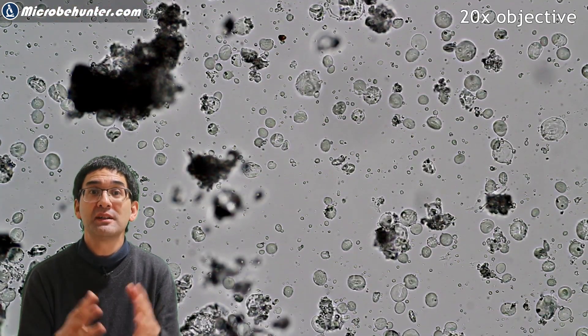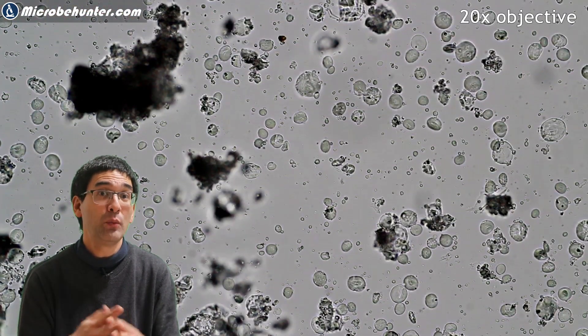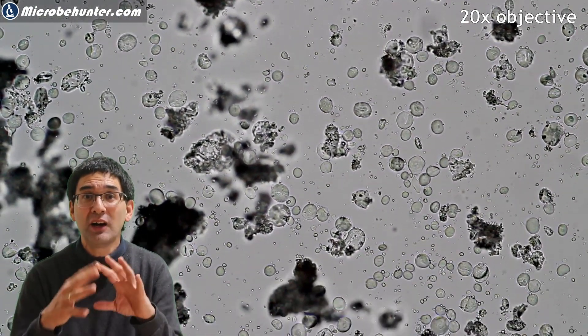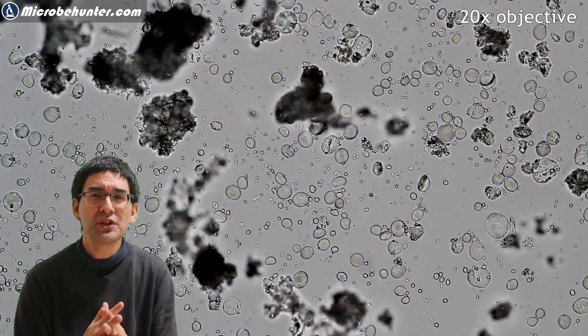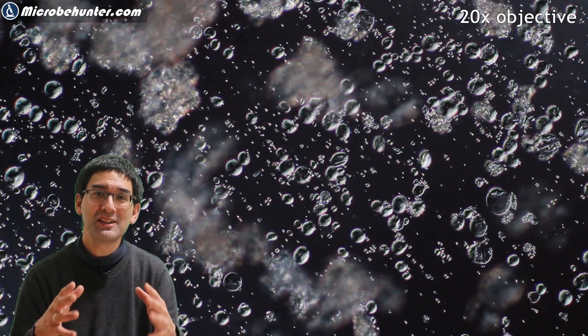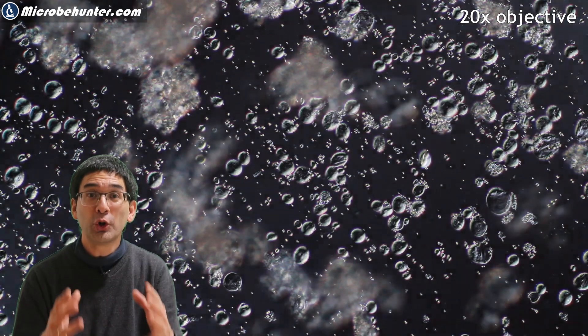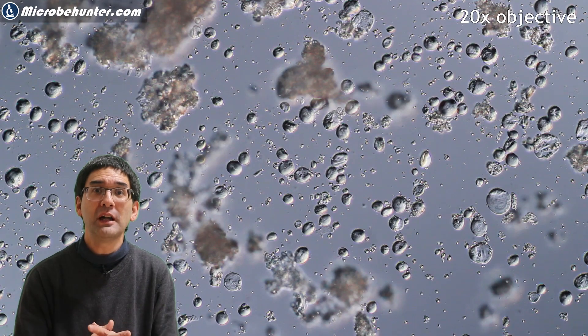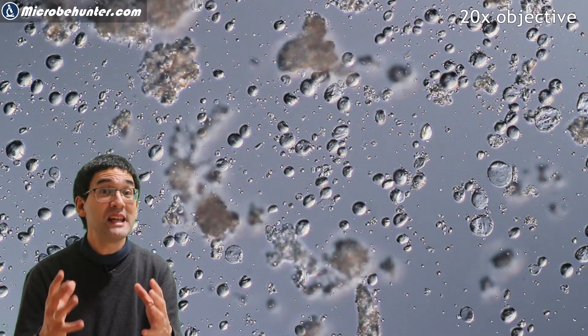When I first put the slide under the microscope I was a little bit shocked because I did indeed see some round, grainy structures. Are these now the spores? Well, after a few seconds I was indeed relieved, because these structures are actually starch grains. Compared to spores they are too irregular and they also do not have the same size.